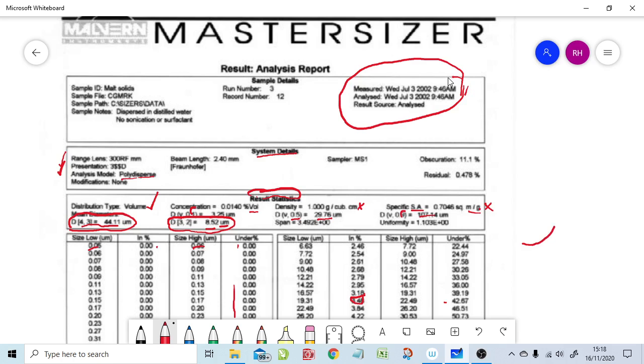This is amount versus particle size, so you could have that going up to 100% at the top here, from 0, and from some particle size x minimum to some particle size x maximum, and the 50% value is the median diameter, which for this material is just under 30 microns. So that's the D50, which is what people typically call it.